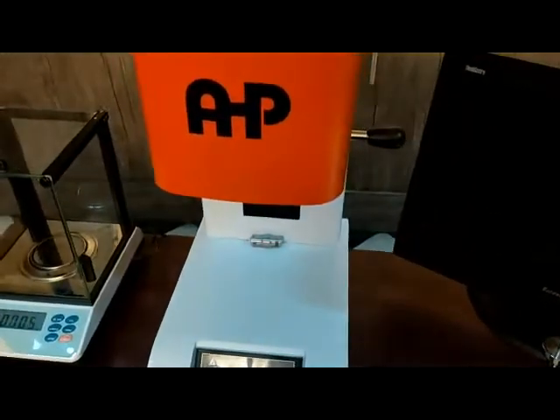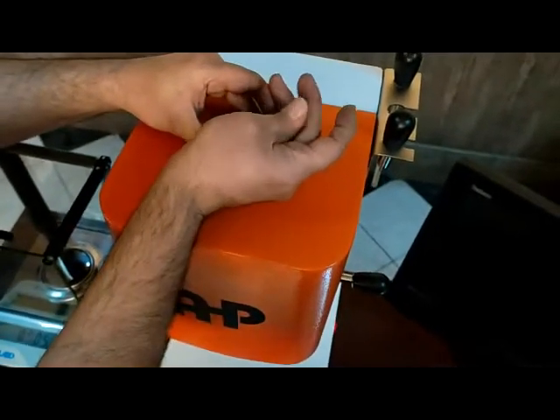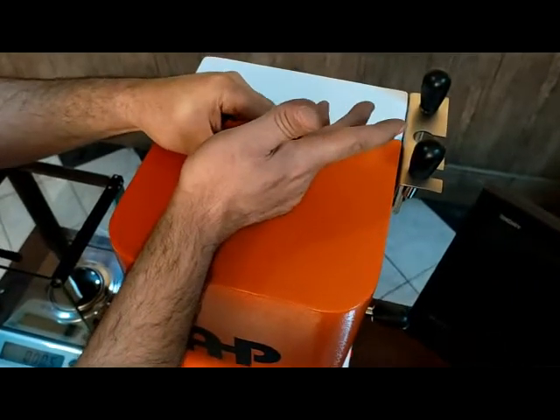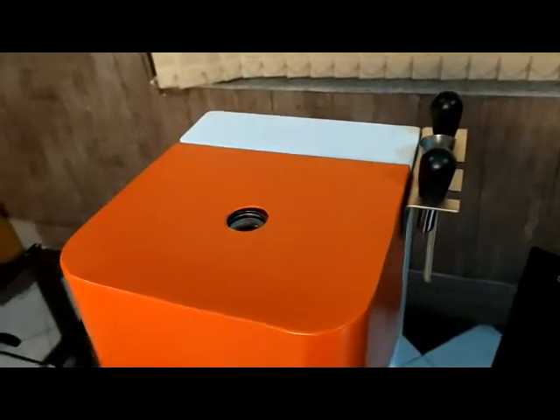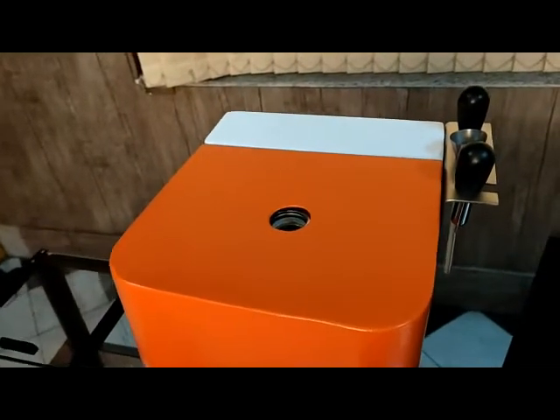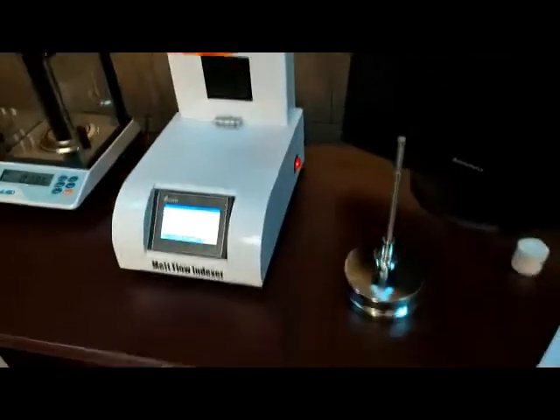Then you pour the material samples into the cylinder and wait for the temperature of the sample and the cylinder to be equalized.